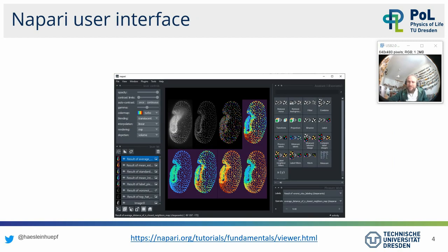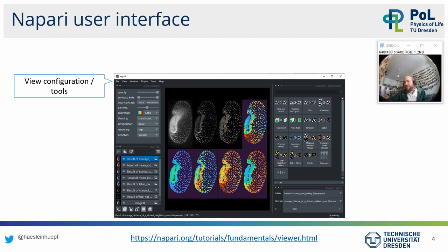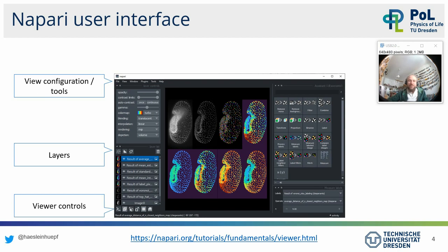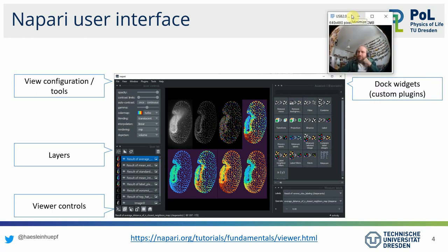If you look at the Napari user interface, it commonly looks like this. Depending on what plugin you have open, you find the view configuration on the top left side. Then there's a list of layers where you can add more layers. There are viewer controls on the bottom left, allowing you to change from a 2D view to a 3D view. On the right, you typically see these dock widgets — custom plugins and extensions of Napari with buttons and text fields.